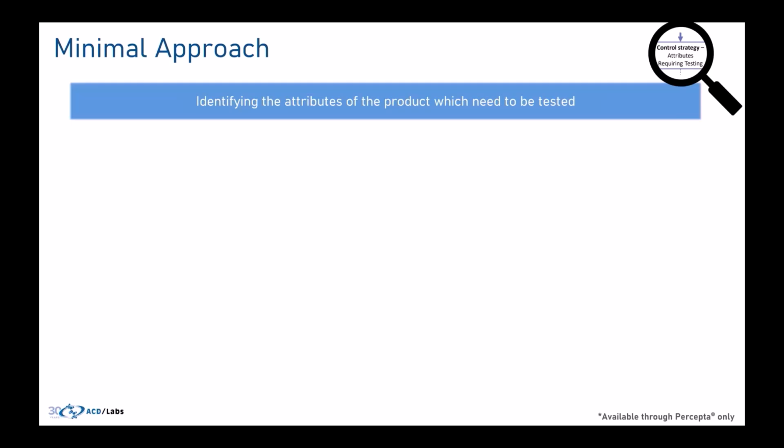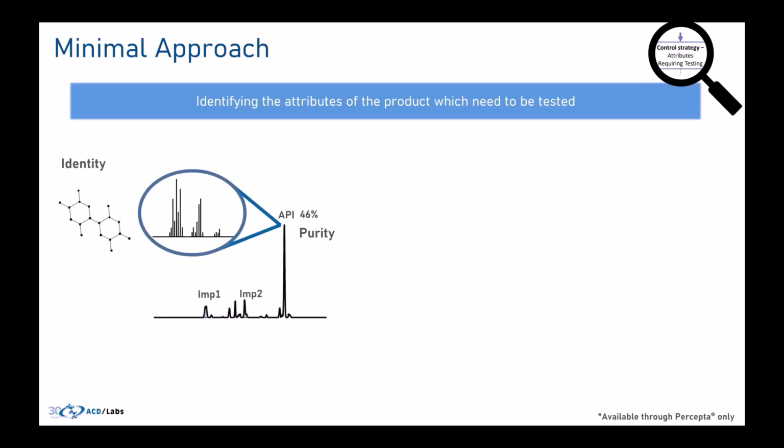Many attributes of the product would not be identified or assessed by HPLC, like uniformity, water content, dissolution, but there is software that can help with things like identity and purity, as well as phys-chem properties. So the software can help you by searching libraries to help in identification. You can perform fragment analysis if you've acquired MS data. Once you've identified the product that needs to be tested, we need to think about chemistry. So our background is chemical structure drawing, and everything in the software can be linked to the structure.